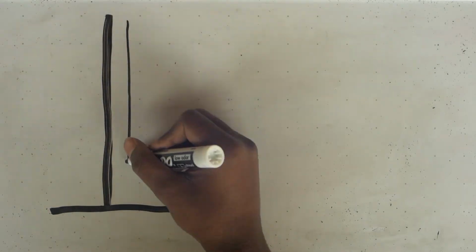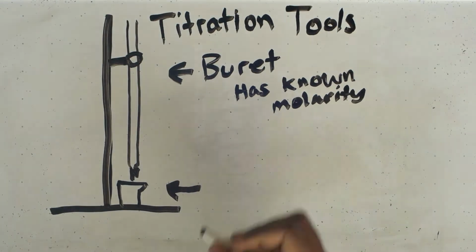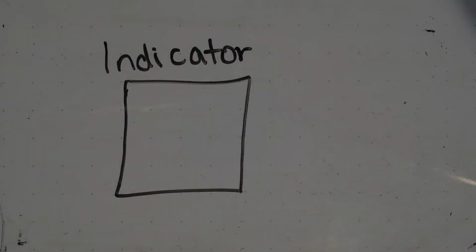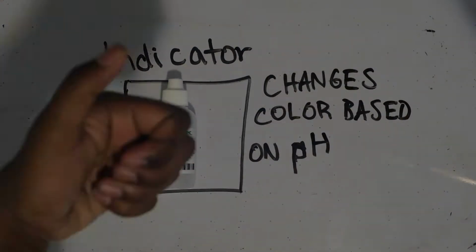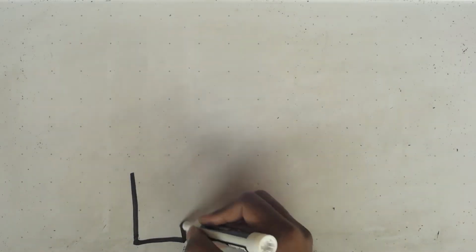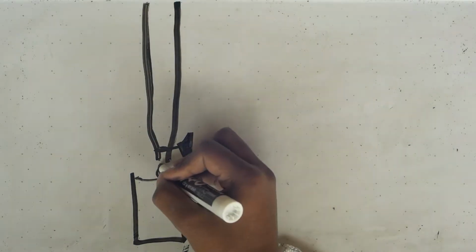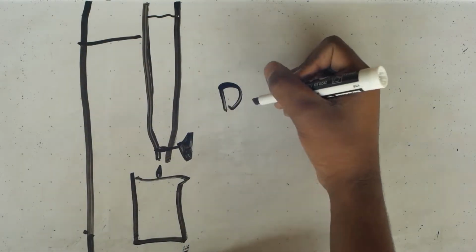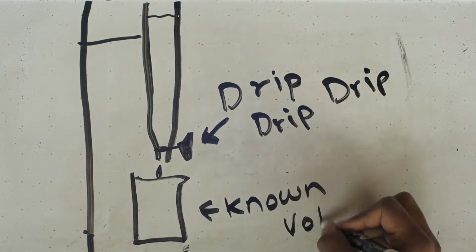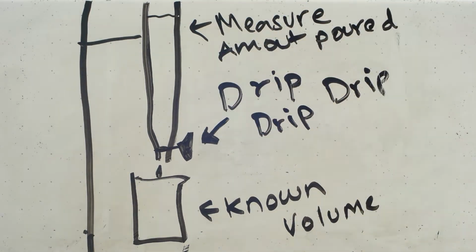The most common way of titration is carrying out a chemical reaction between two solutions by the controlled addition of a burette from one solution into the other. An indicator or pH meter must be used in the titration to locate the equivalence point. When titrating, an acid could either be added to a base or a base can be added to an acid. Both will result in the same equivalence point, as they both consume each other until neither reactant is in excess, which leaves us at an equivalence point of 7. Let's see an example.